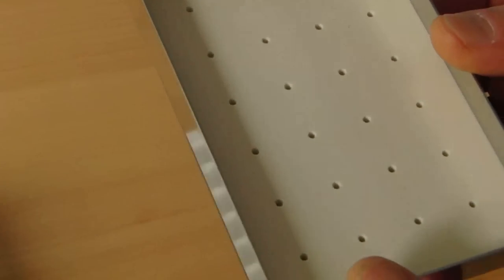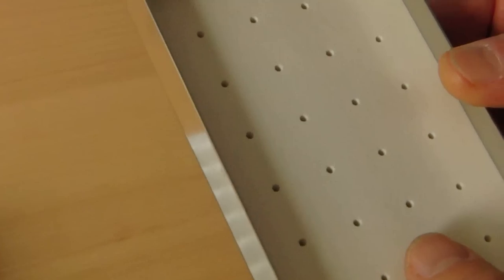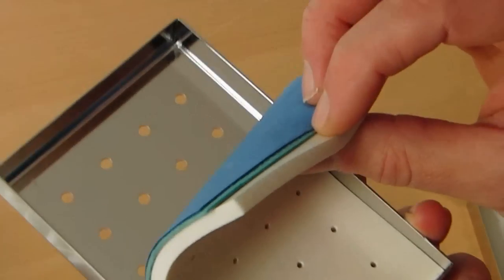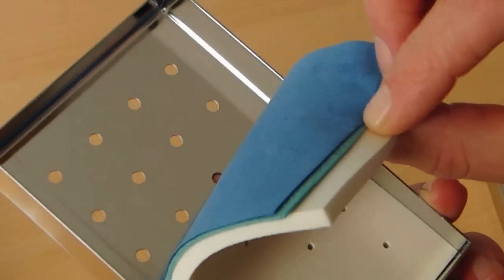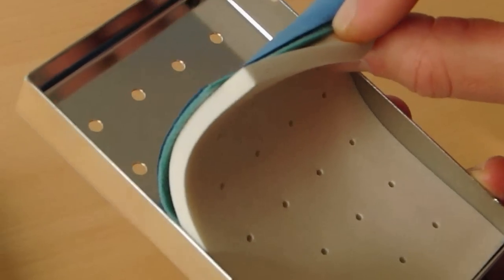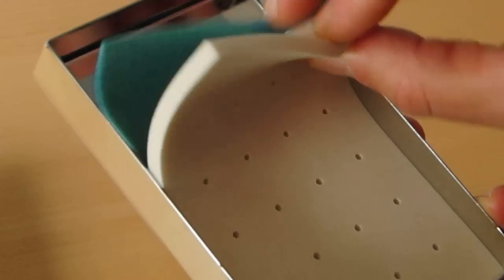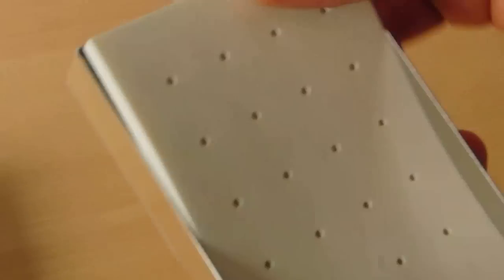Sandwich covers are the heart of our cultivation system and consist of the following components: a rigid stainless steel part which gives the cover the necessary rigidity, two filter layers to prevent airborne contaminants from entering the wells—a microfiber filter and an expanded Teflon filter. Here you see the expanded Teflon filter.